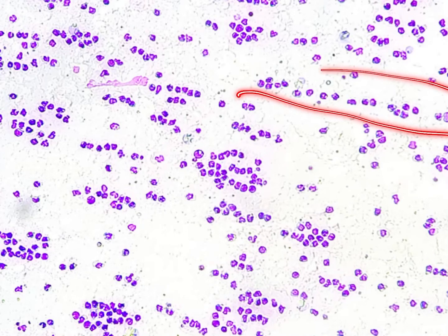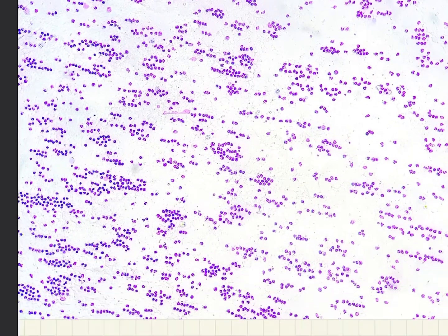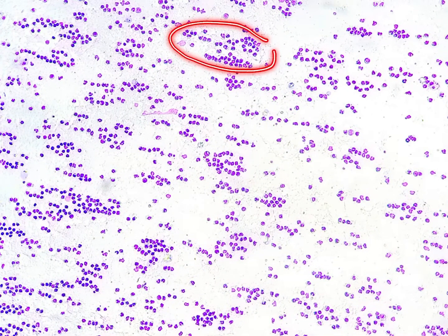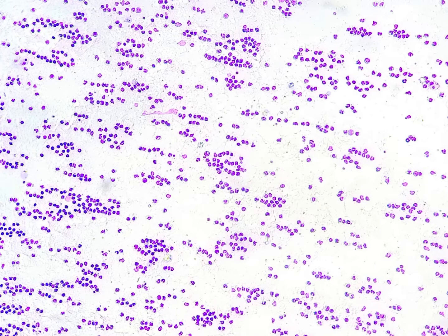You can see the arrangement of the cells — they are arranged one after another, here, here, almost everywhere. This arrangement is called the windrowing effect. The windrowing effect is commonly seen in high viscosity fluid.